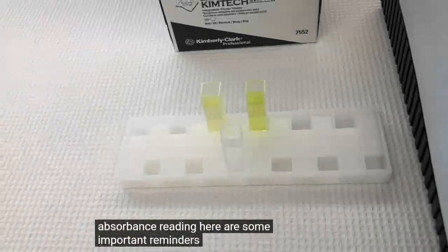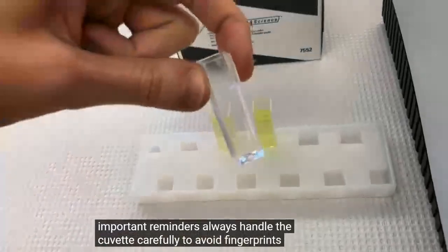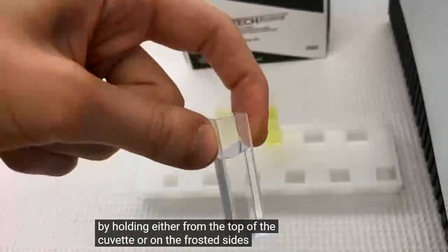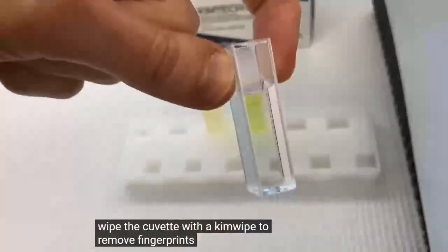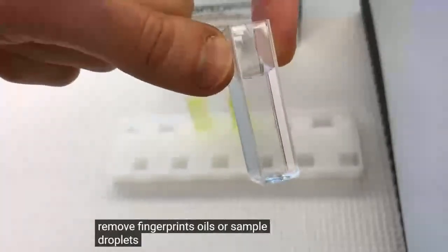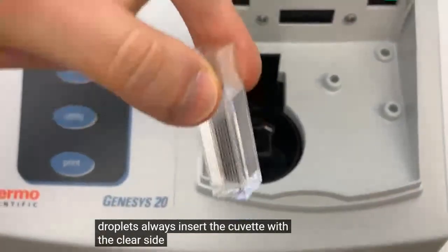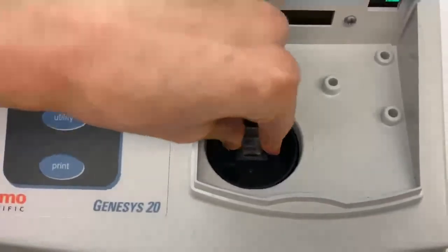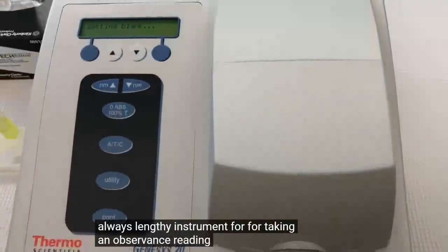Here are some important reminders. Always handle the cuvette carefully to avoid fingerprints by holding either from the top of the cuvette or on the frosted sides. Always wipe the cuvette with a Kim wipe to remove fingerprints, oils, or sample droplets. Always insert the cuvette with the clear side facing you. Always blank the instrument before taking an absorbance reading.